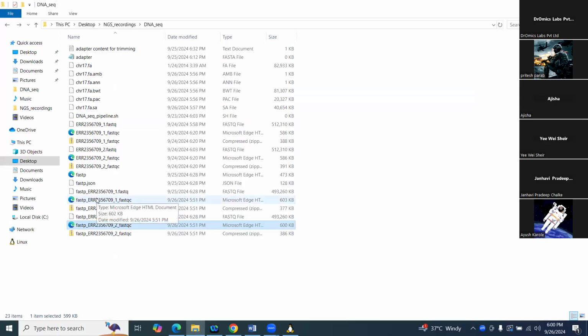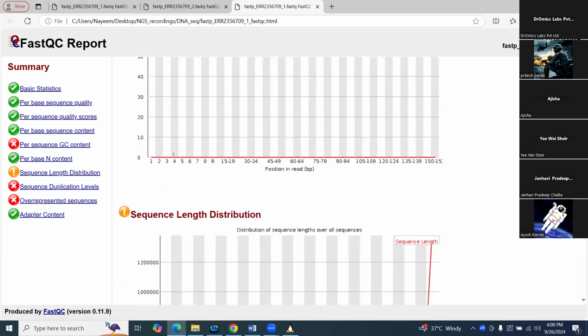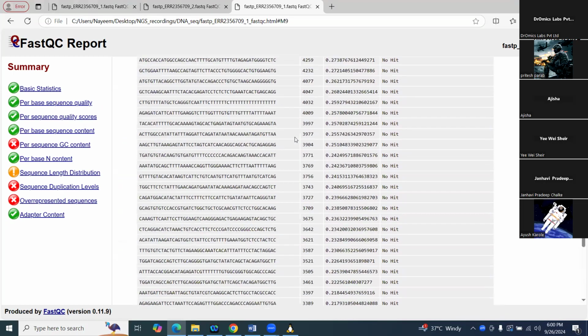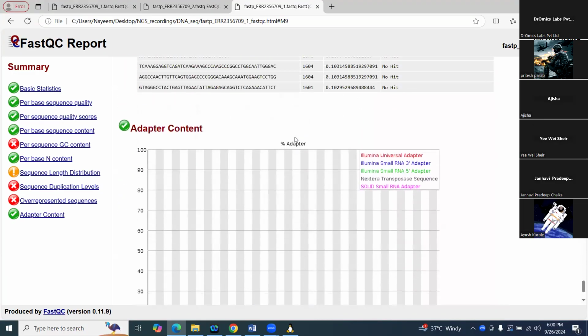Okay, open that file and open the previous file also. This is before trimming, and this one is after trimming. Have you mentioned the sequence in your file properly? No, I think I missed it. Maybe you have mentioned the reverse adapter sequences into the forward file. Maybe that may happen. Actually, I copied that in a notepad. I didn't know how to relate this one.